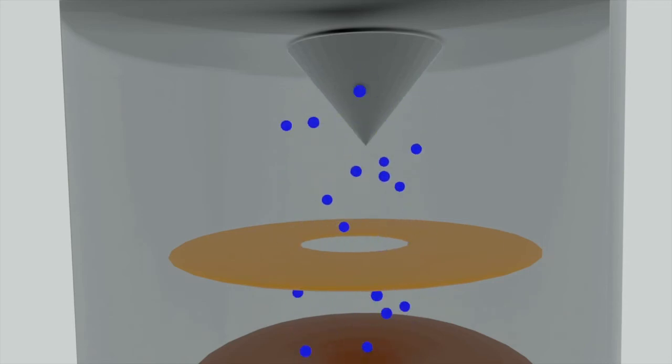Those electrons then travel through the first part of the chamber, it being the anode. The anode attracts the electrons to then give the electrons an orientation to travel as a beam.